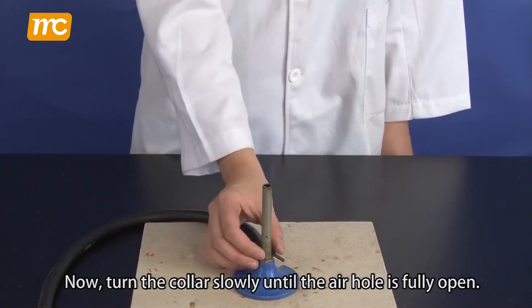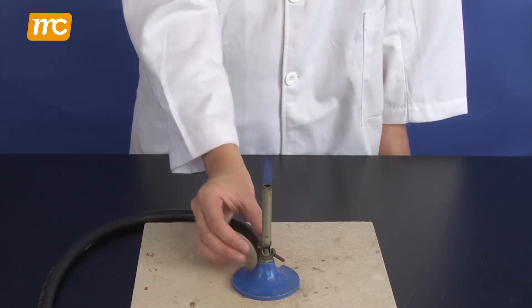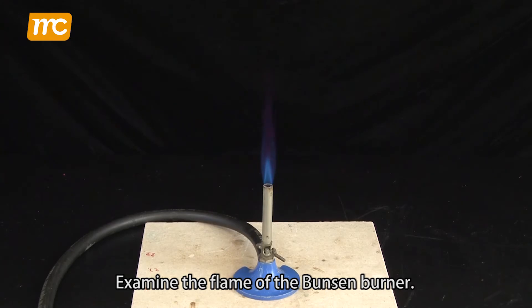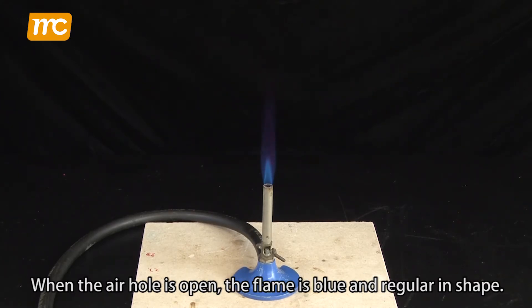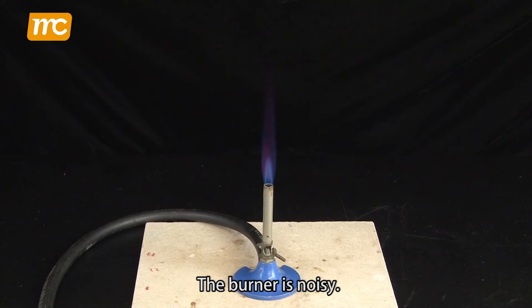Now turn the collar slowly until the air hole is fully open. Examine the flame of the Bunsen burner. When the air hole is open, the flame is blue and regular in shape. The flame is non-luminous and the burner is noisy.